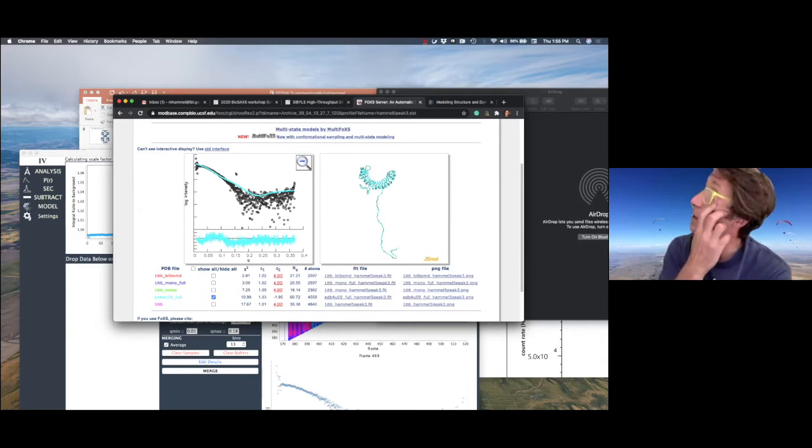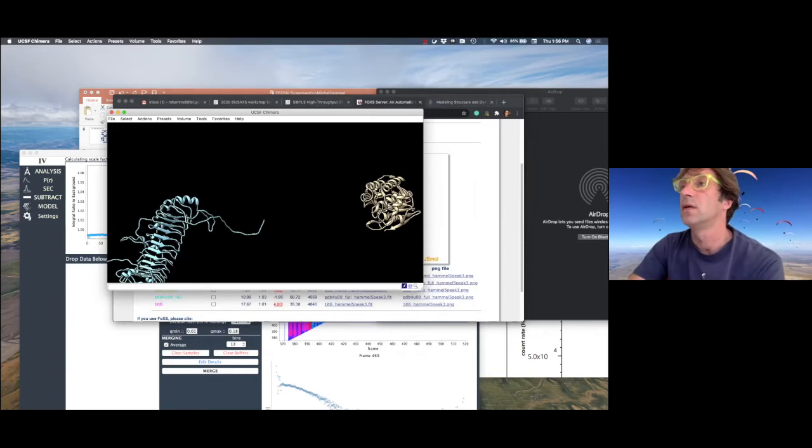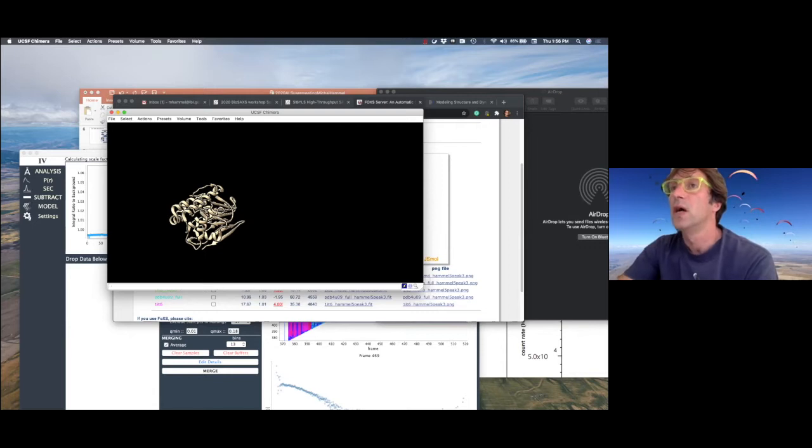And one of our attendees has a question: how are we going to deal with the modeler? So most crystal structures or cryo-EM structures are missing regions. And as Greg mentioned in the first introduction, whatever you put in a solution is scattered and will be seen by SAXS. So when you look at the PDBs, you need to be sure that you have the entire molecule rather than only what you see in a crystal structure. How to deal with that?